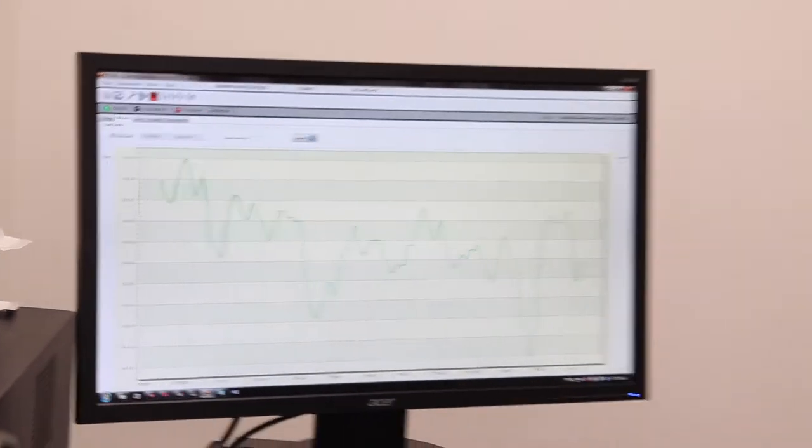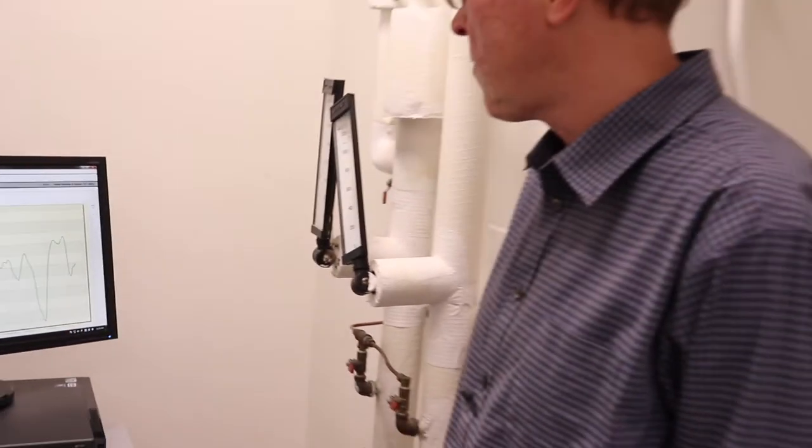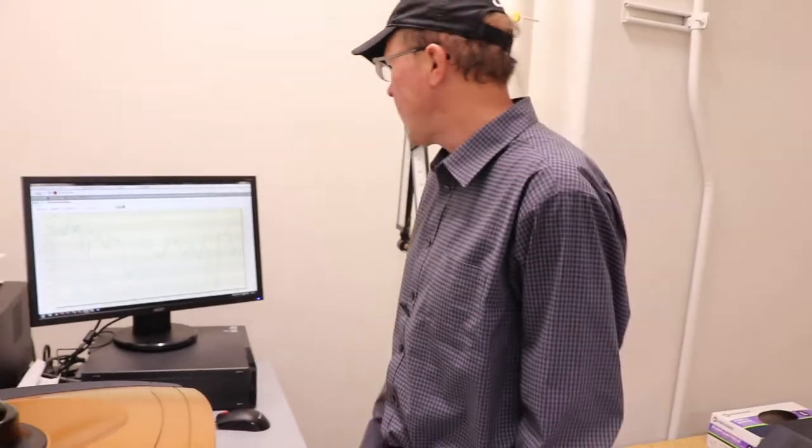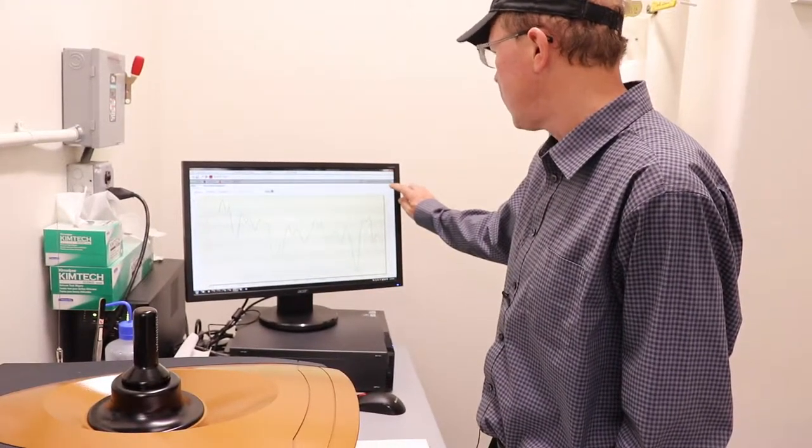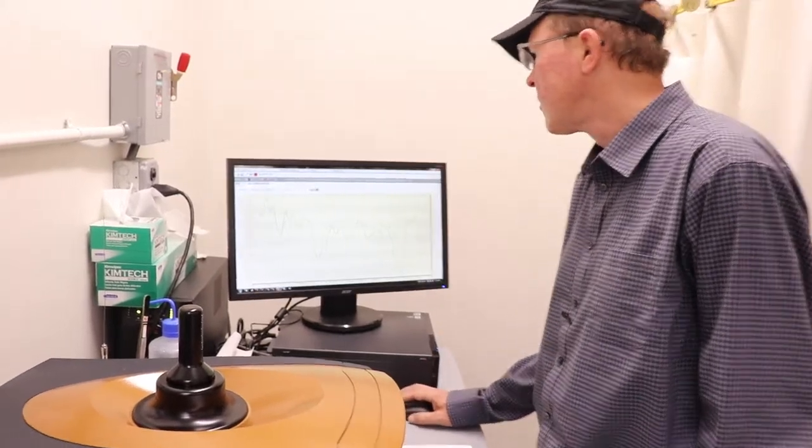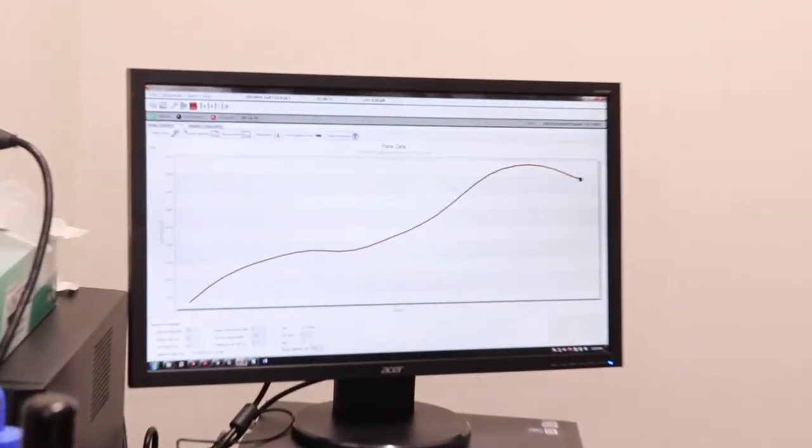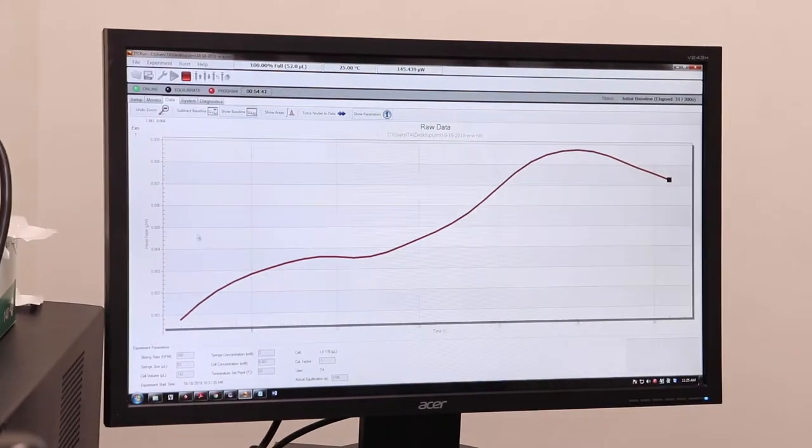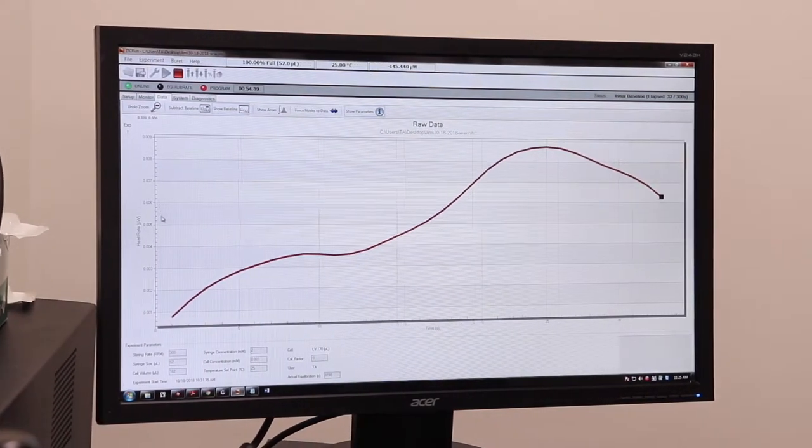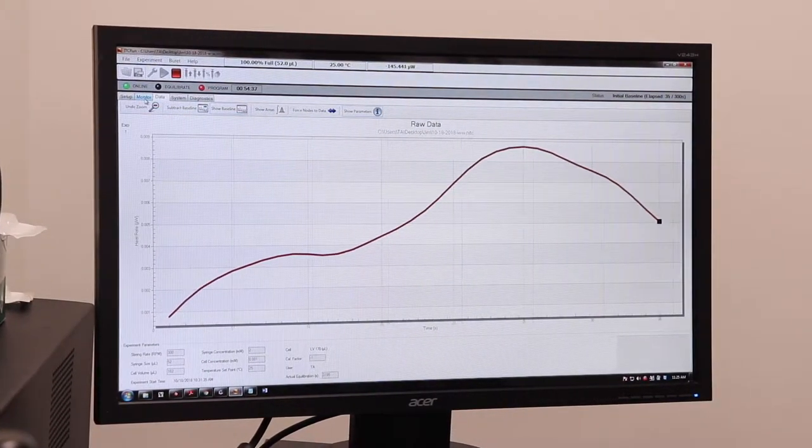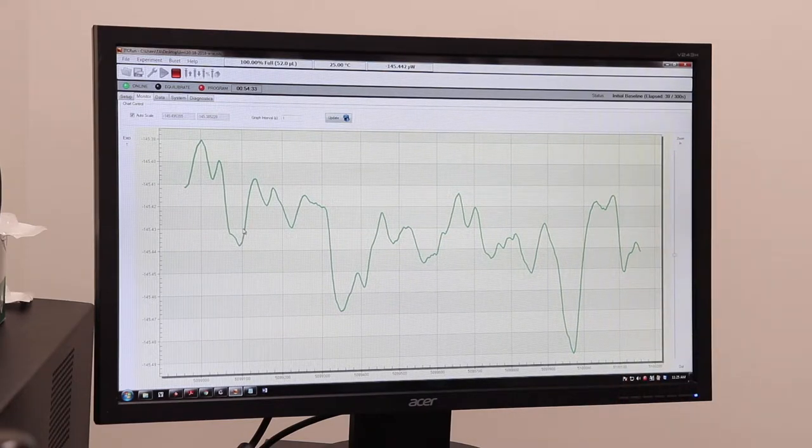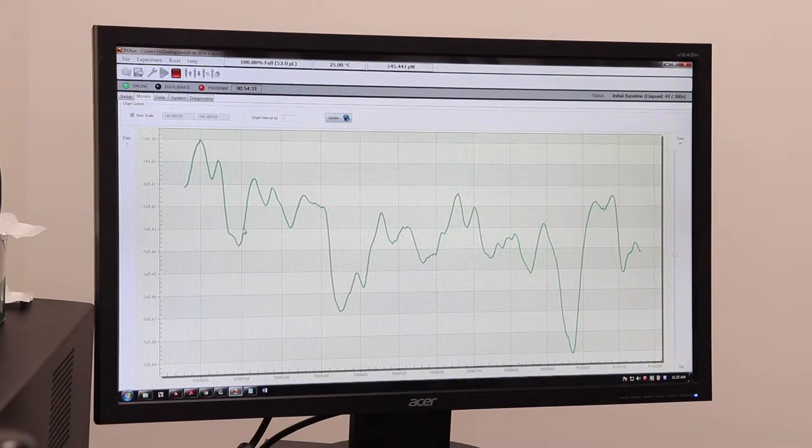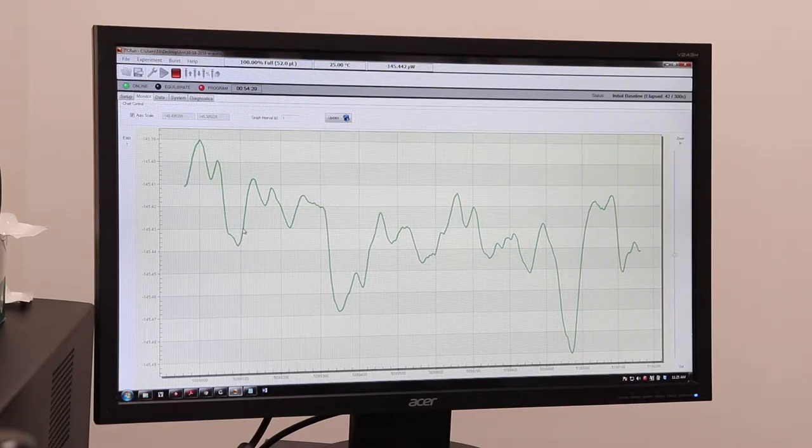Okay, once the auto-calibration found a proper slope and standard deviation, it's going to collect data and get an initial baseline for 300 seconds. Look at data here. Also that has an auto-scale on the y-axis. After that first 300 seconds, it'll inject the first peak, then inject the rest of the peaks and take about 45 minutes for the end of the experiment.